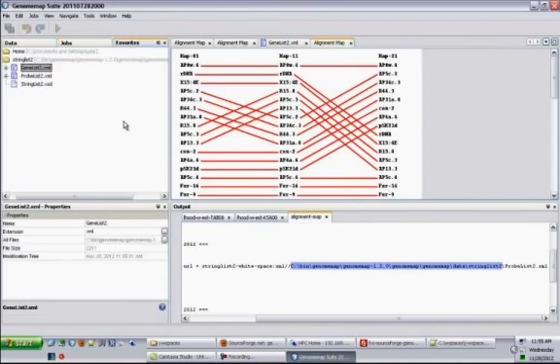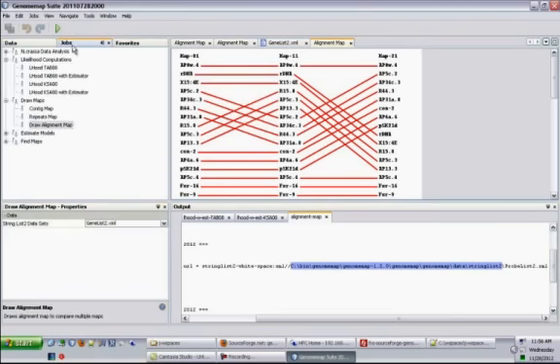Not only that, we can also create more datasets, new datasets. We can just copy and then paste in this directory, and now we have another dataset. So we can have multiple datasets for playing with it. So here when you come here, you see only 2, but if we restart the application, let's restart the application, and we will see that dataset appearing here.